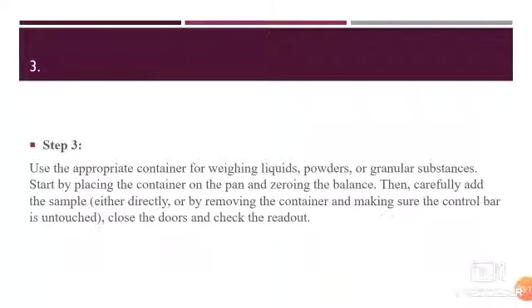Step number three: use the appropriate container for weighing liquids, powders, or granular substances. Start by placing the container on the pan and zeroing the balance, then carefully add the sample, close the doors, and check the readout.